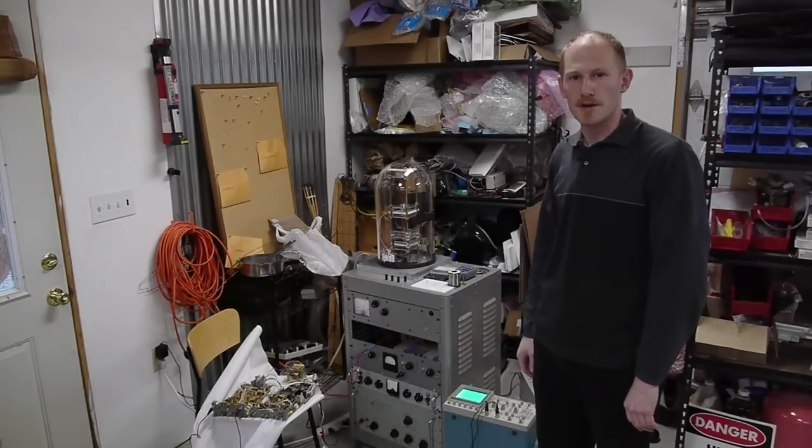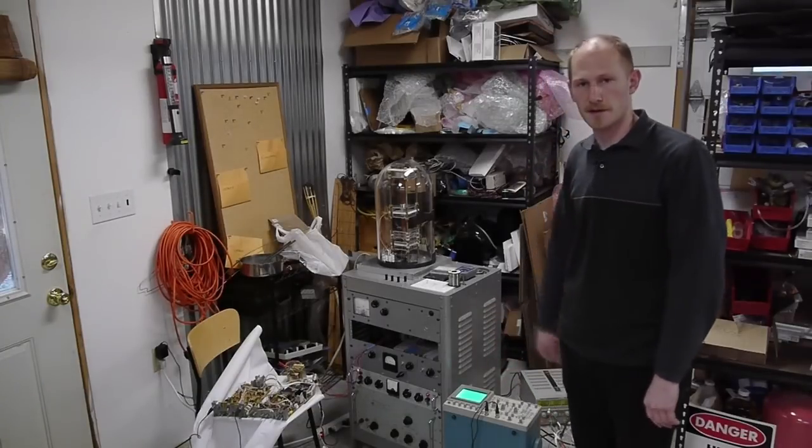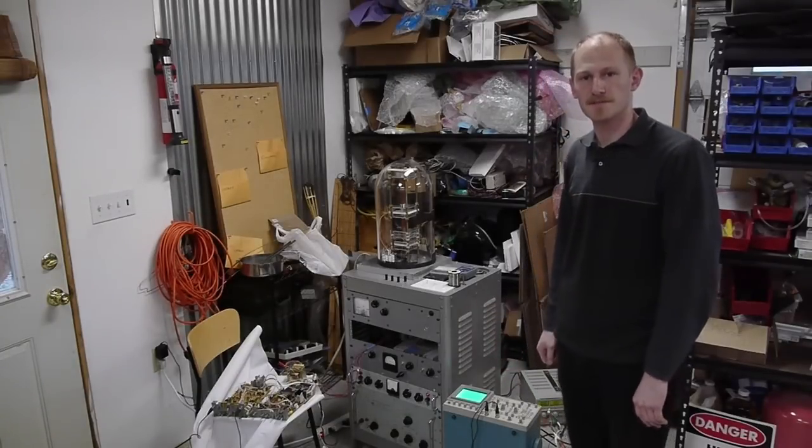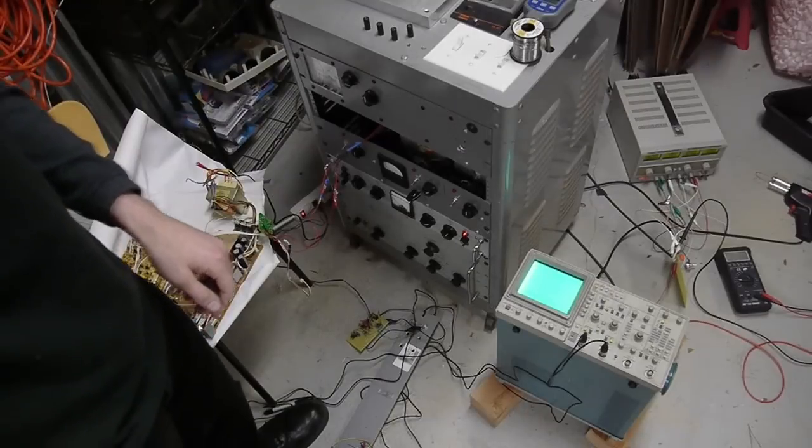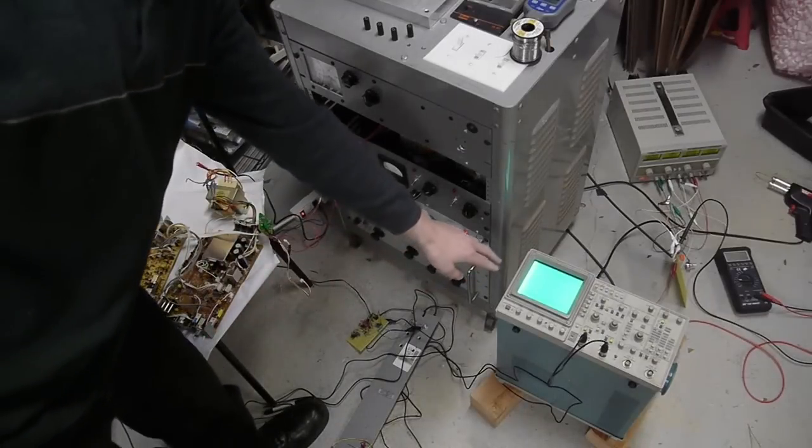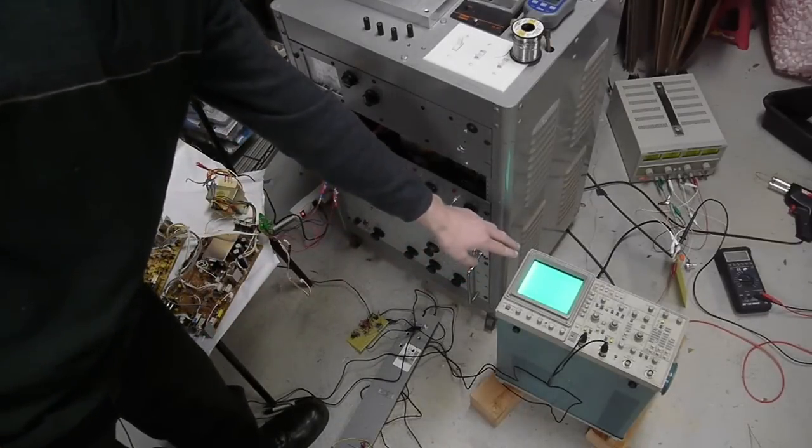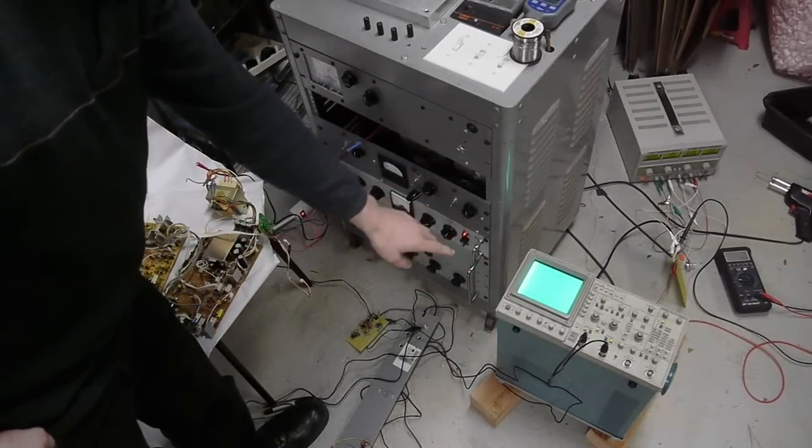Let me move the camera in and show you what I've got hooked up today. Okay, so here's my Tektronix 2246 analog oscilloscope.